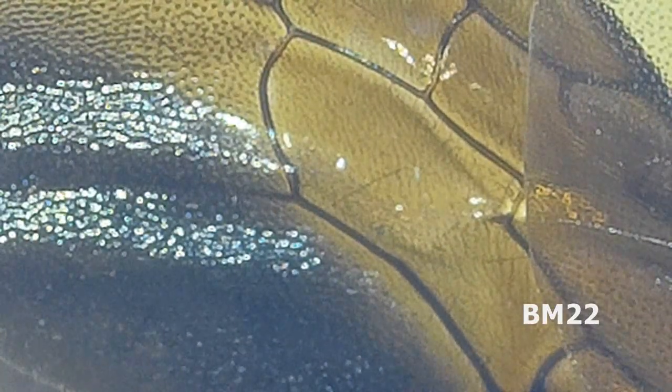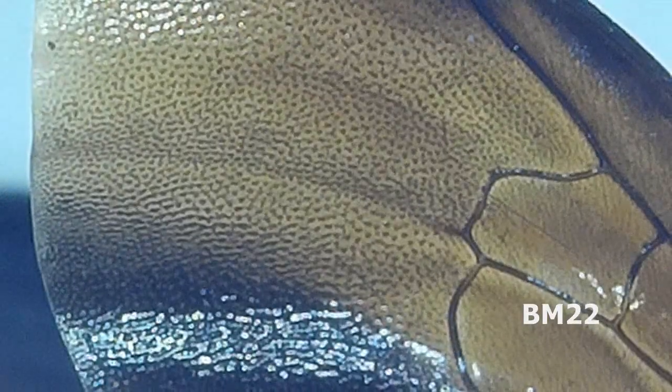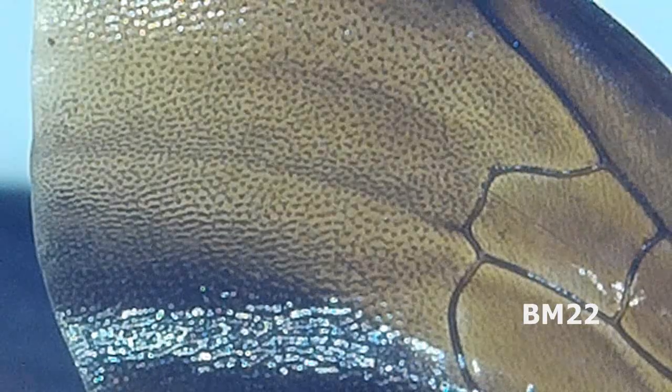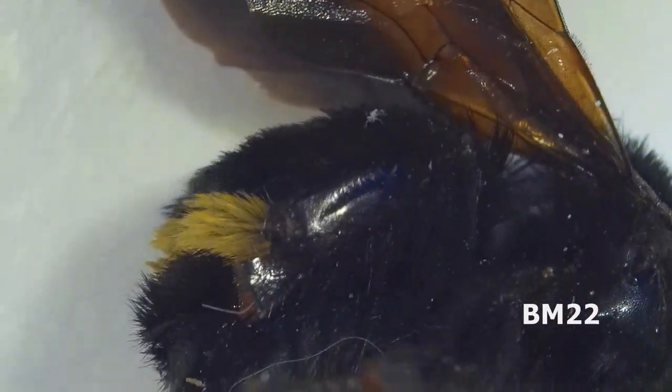But that makes this no less interesting, right? The main thing I wanted to show you — the purpose of this video — is to compare what the wings look like between the bumblebee and the yellow jacket, because when you compare their wings, they are significantly different, and they are both very cool looking. Though I do think the bumblebee's wings are actually cooler looking. There is a difference in shape, design, style, and texture.